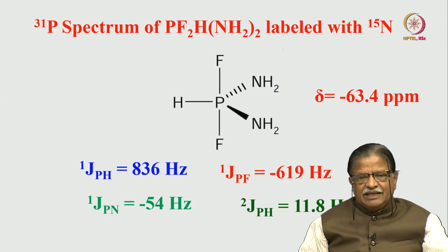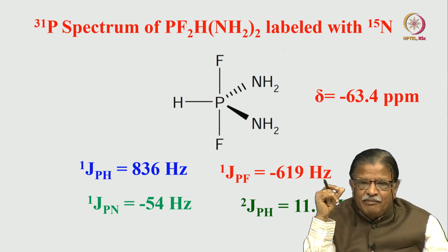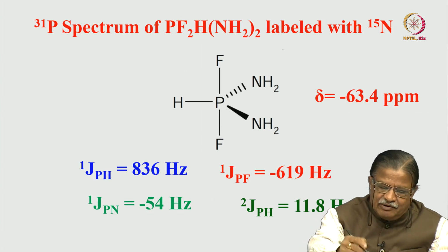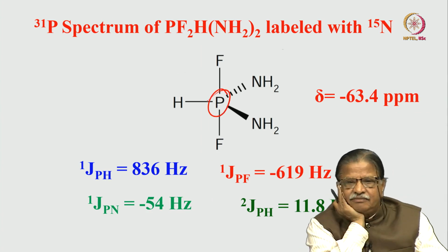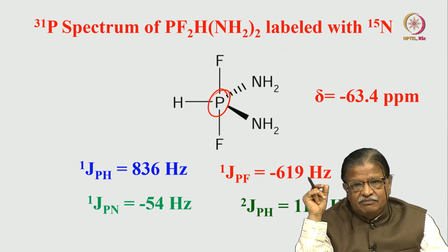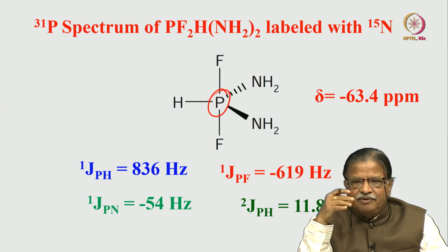Next we will go to another simple molecule, phosphorus, very simple molecule. Can you imagine a simple molecule, this phosphorus I am looking at, will give an enormously complex spectrum? Hard to believe, right? Looking at a simple molecule.